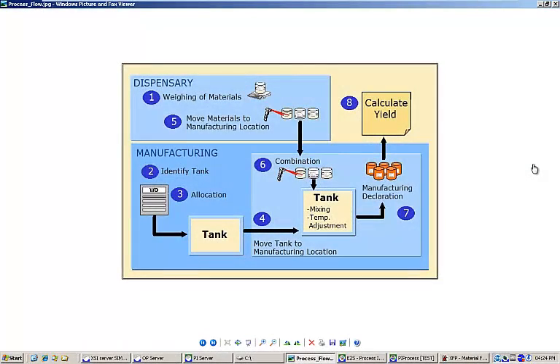Hello, my name is Brandon Johnson and this video continues my demonstration of the Siemens Somatic IT XFP Manufacturing Execution System platform.